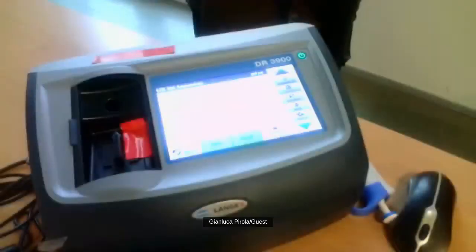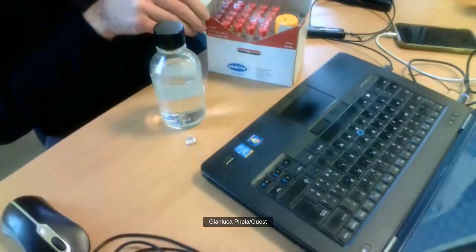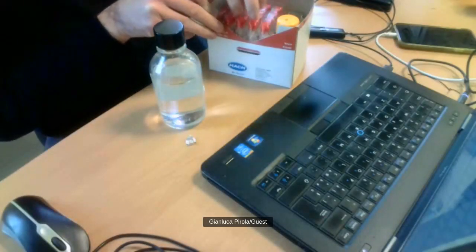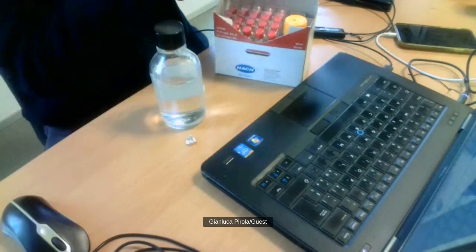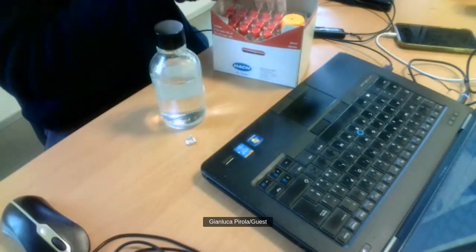We have also, for example, here nitrate. With nitrate, we have to put 0.2 milliliters of sample.